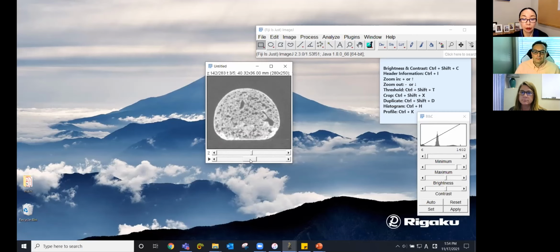This is how you can create one file that has a time axis. For CT scans, you have only one grayscale channel. If you do the same thing for optical microscopes, for example, then you will probably have 3 channels, and you can do the same thing. You will just have a channel slider, and you have the Z and time. You will have 3 lines at the bottom, but this is how you can create one stack with a time axis.